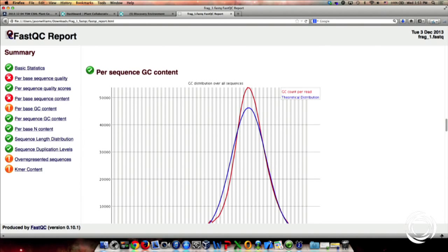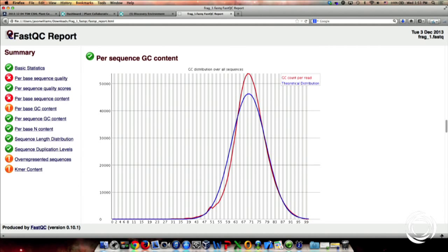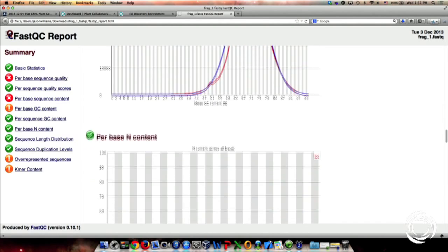If you see that this profile is not smooth, if you see another hump, your data are contaminated by another species. I have seen this on several projects where we thought we were sequencing Rhodobacter, but then there's this weird other hump there. There was something else in your data. It's the most coarse-grained metagenomics analysis you can do, just looking at GC content, but you'd be surprised at how effectively you can recognize problems that way.